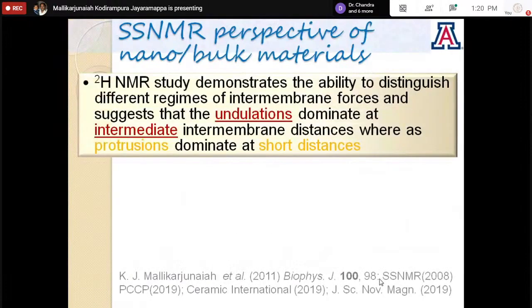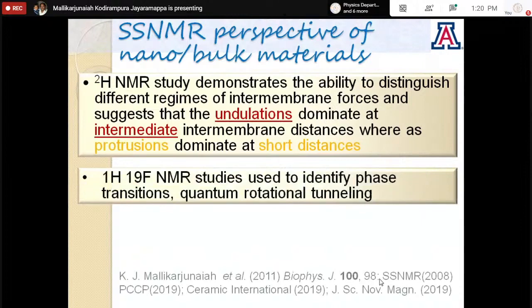Okay, with that, I would like to conclude my topic with these summary points. Deuterium NMR demonstrates short distances, and for biological applications, we can study the physical properties of biological samples, because the lipid molecule behaves like a liquid crystal, and all liquid crystal theories can be understood better and correlated to drug industry applications.